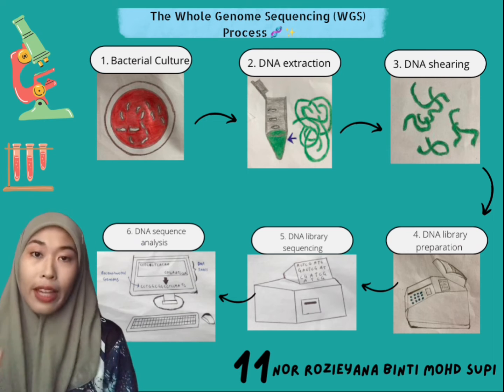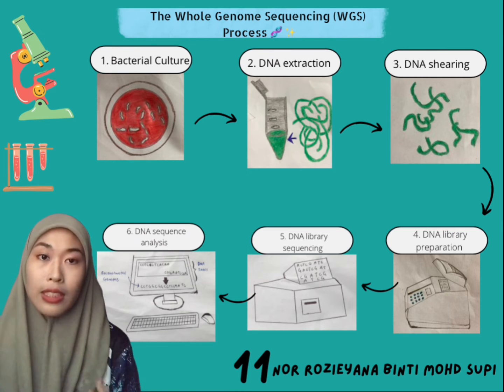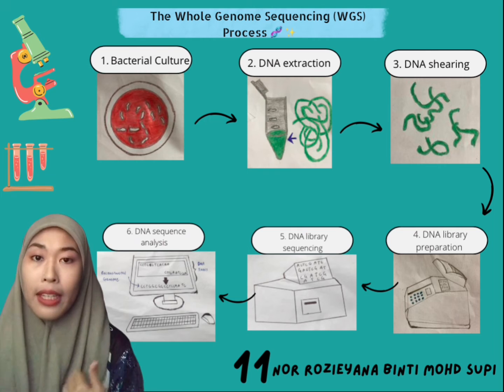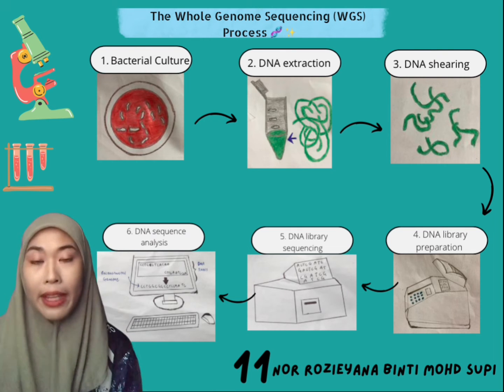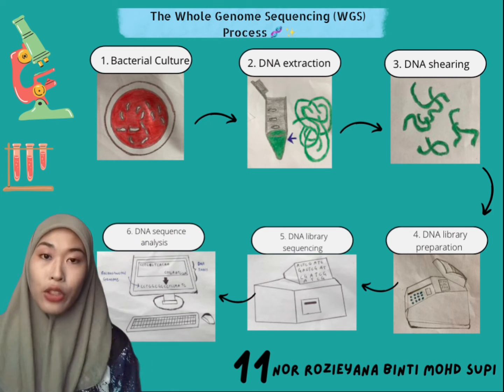First, DNA extraction. Researchers tear open bacterial cells on an agar plate using chemicals that spread them open and release the DNA. After that, the DNA is purified. Second, DNA shearing.